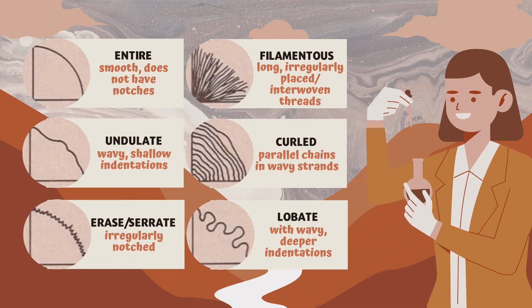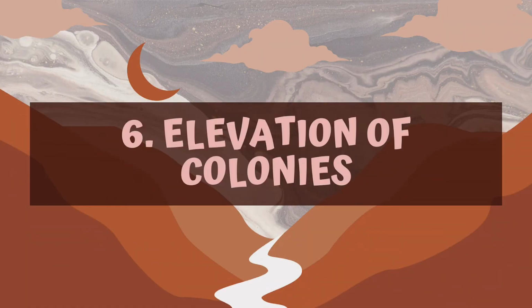These are entire, undulate, erose or serrate, filamentous, curled, and lobate.